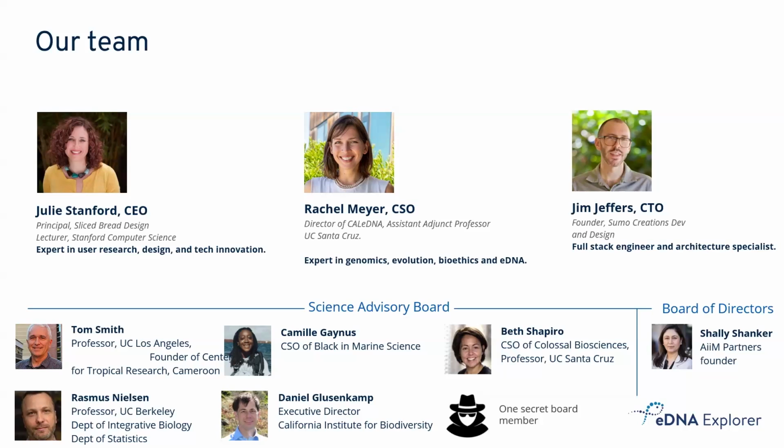My background, I'm the director of the California Environmental DNA Program, where I've been helping people get into the eDNA field for the last 8 years, and we've really recognized the power of data integration and methods integration. And then Jim Jeffers has his own really cool web software development firm, Sumo Creations, and we are now the leaders of eDNA Explorer, and we have a really great scientific advisory board, and we're growing our board of directors.